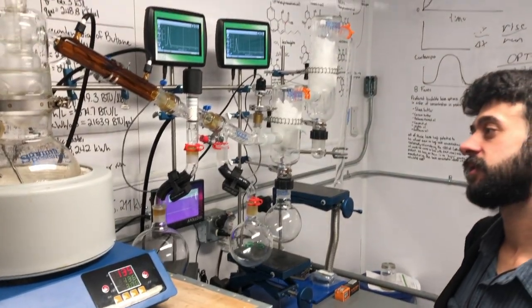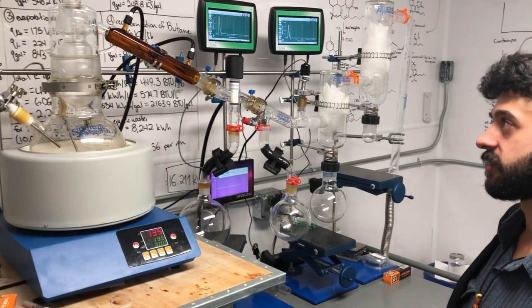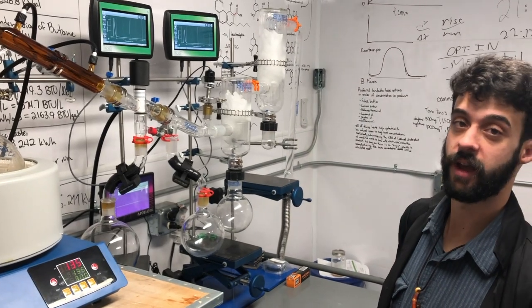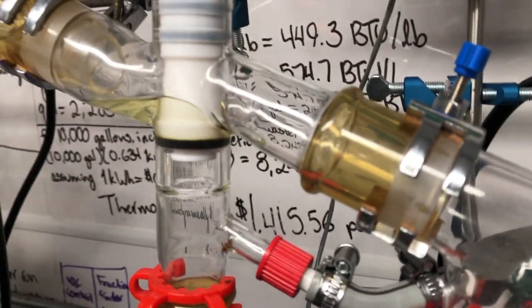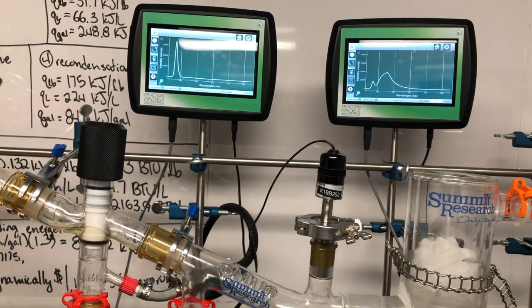Second pass distillation of the CBD dominant first pass distillate that we finished yesterday, off our CBD dominant crude from our hemp fields. Serious hump in the middle. It's pretty good. Now we're just going to get a bunch of bulk crap real quick.